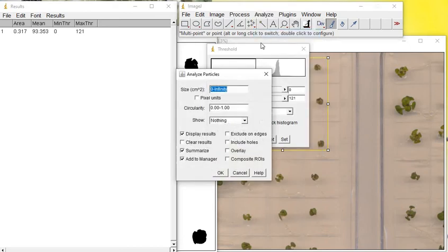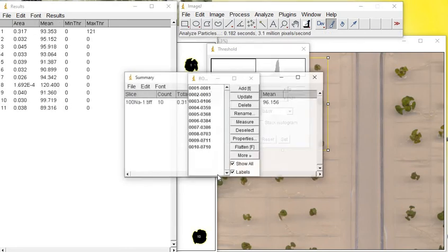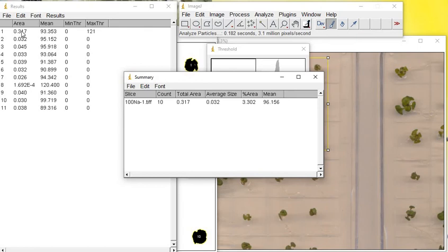When you use Analyze Particles, I set up zero to infinity, zero to one for circularity, and to show nothing. Check Display Results, Summarize, and Add to Manager. When I click OK, you can see the same value as in the Measure function - it's the same as in this Analyze Particles function.